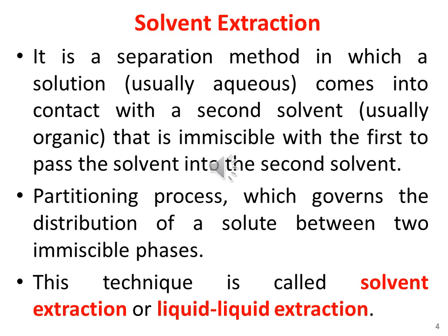So in this separation technique, the solute goes from one phase into another phase, and the distribution of the solubility of the solute between the two phases is governed by the partitioning process.